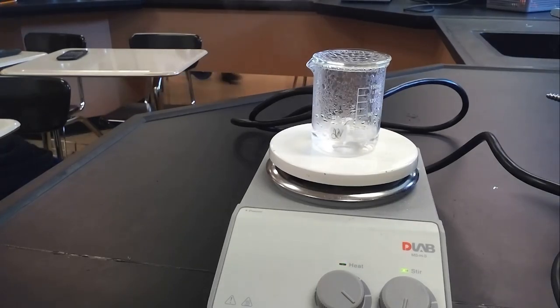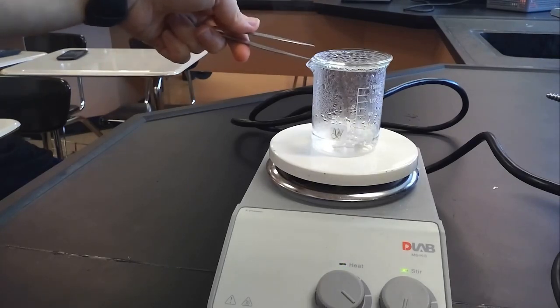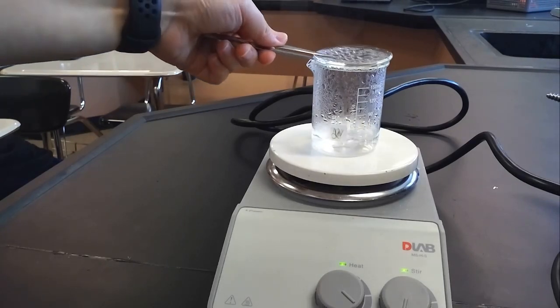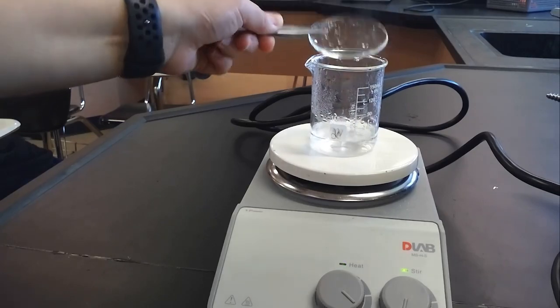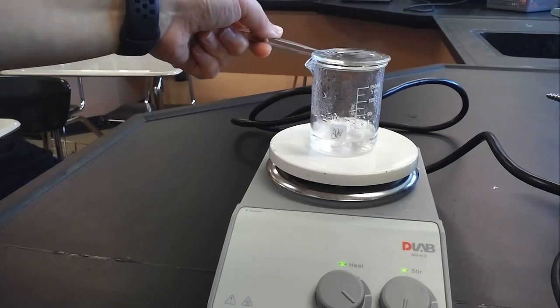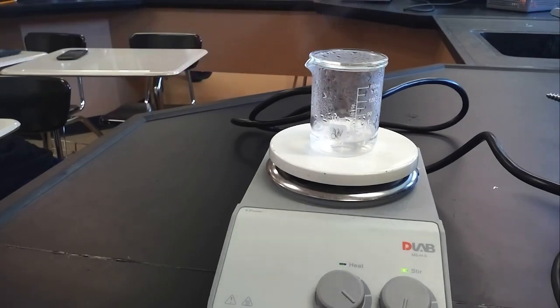It's definitely boiling now and we're getting a lot of condensation on the watch glass on top. Once it gets hot enough we'll get crystallization of our solid on the watch glass, which is why we want it there. We can force that condensed liquid back down into the beaker. We want all the water vapor to be gone before we take the final mass.